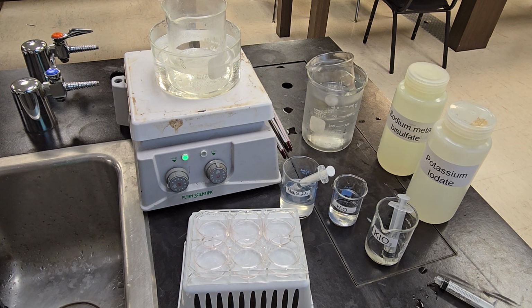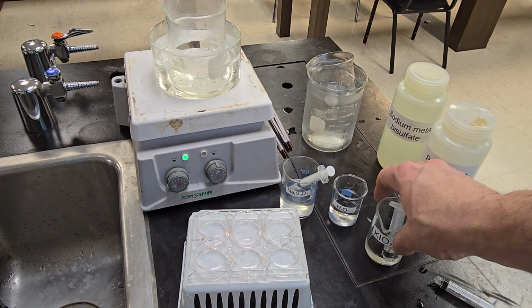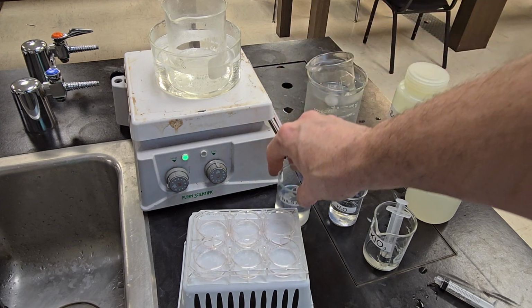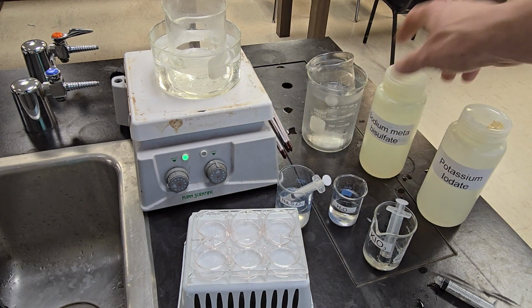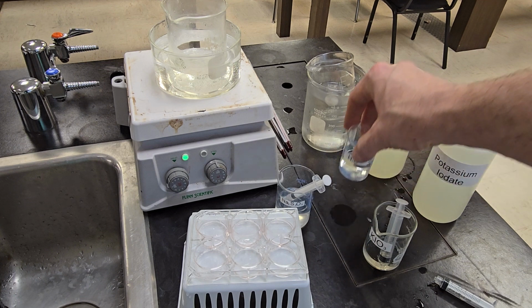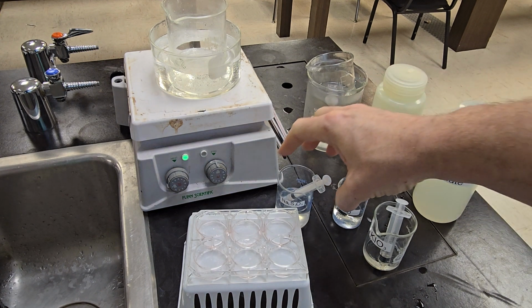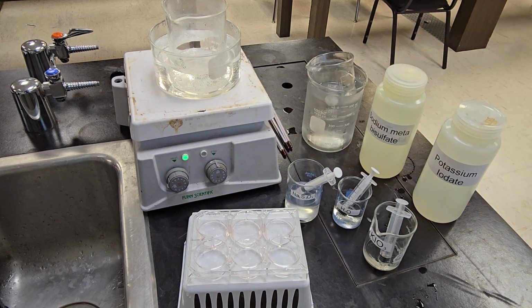My main chemicals I'm using, as it said, is potassium iodate. And then we also have something called sodium metabisulfate. These are my two chemicals right here. The last chemical we'll be using is plain water. We need to make sure not to cross-contaminate at all. Only mix chemicals when we are supposed to, otherwise we ruin our experiment. So I'm going to set up my plates now.